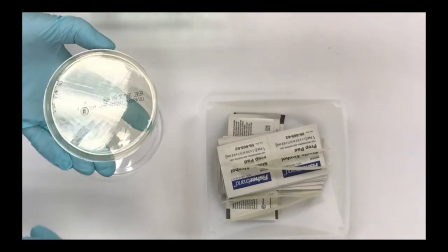On the surface of this, you can see there are a couple letters written. In this case, it's TE for tetracycline. So you can see what antibiotic you have, so there's no need to label the individual antibiotic discs. That's already done for you.